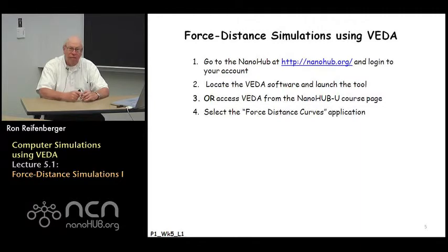I've also used red circles to indicate input values that you have to select and you should maybe be focusing on when you try to do these simulations. My advice is probably to print out the slide lectures and have them in front of you when you do the simulations, because that way you can refer to the screen capture to make sure that what you're entering into the computer is exactly the same as the parameters that I entered in.